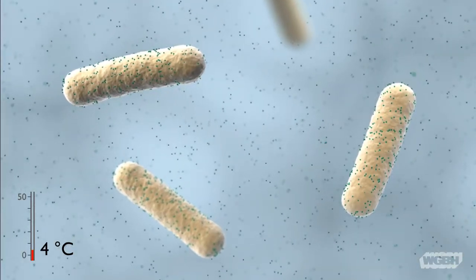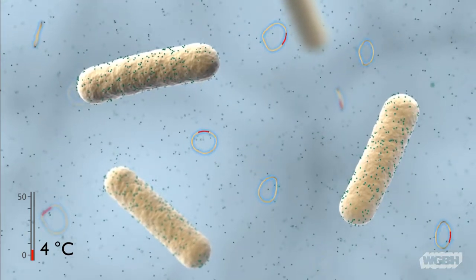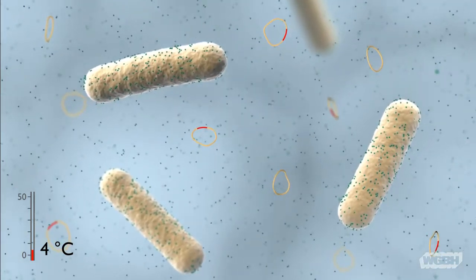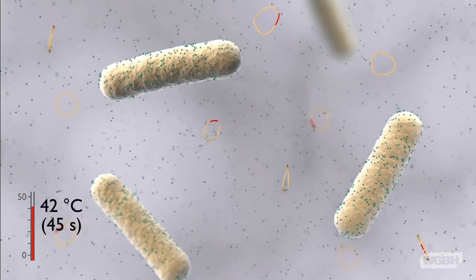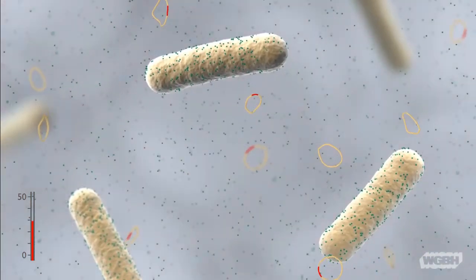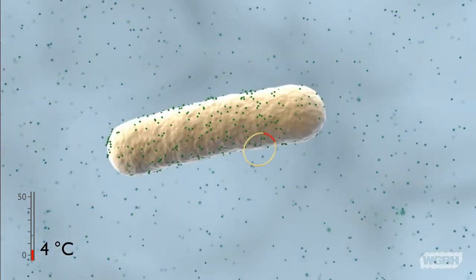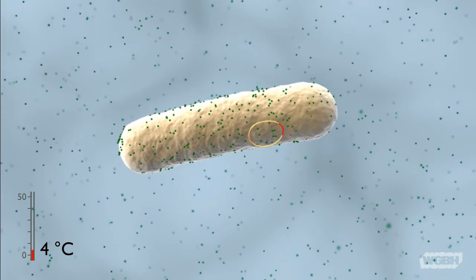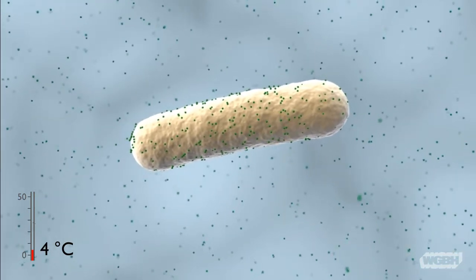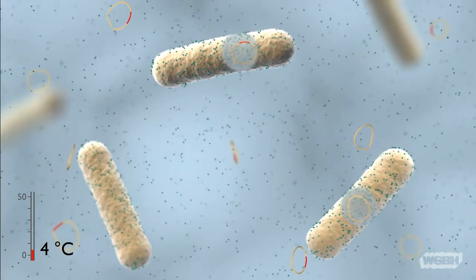Plasmids containing the gene of interest, RFP, are then mixed with the treated cells at 4 degrees Celsius. The temperature is quickly increased to 42 degrees Celsius, and then reduced back to 4 degrees Celsius. This heat shock results in the formation of adhesion zones, creating a leaky plasma membrane. This may enable the cell to take up a plasmid from the solution.